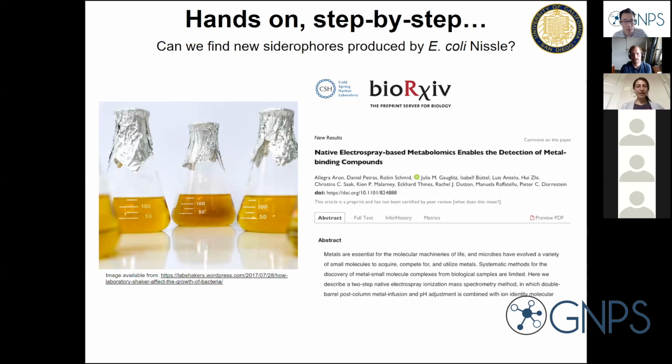Okay, great. So hi, everyone. I'm Allegra, and I'm also a postdoc in Peter's lab. Today I'll introduce the data set that we'll be investigating in the hands-on portion of the tutorial. This data set is one that we ran on E. coli Nissle culture extracts, and we ran it on the Q-Exactive mass spec.